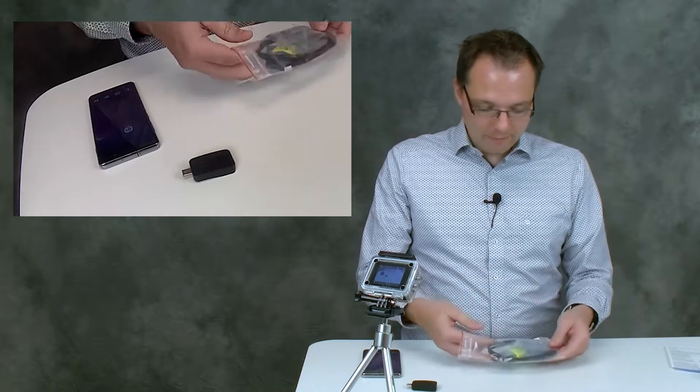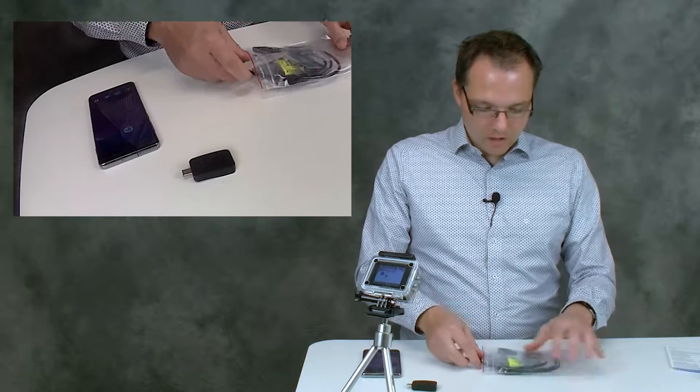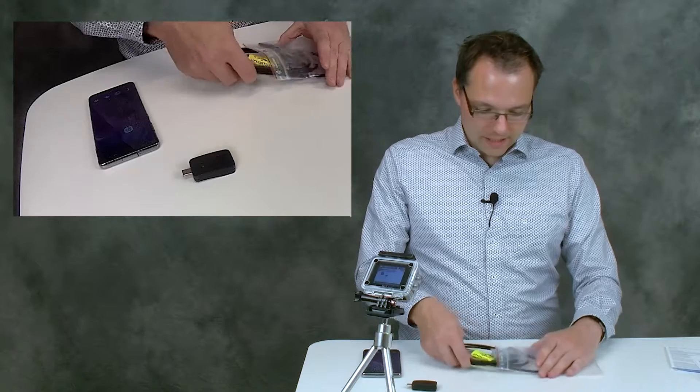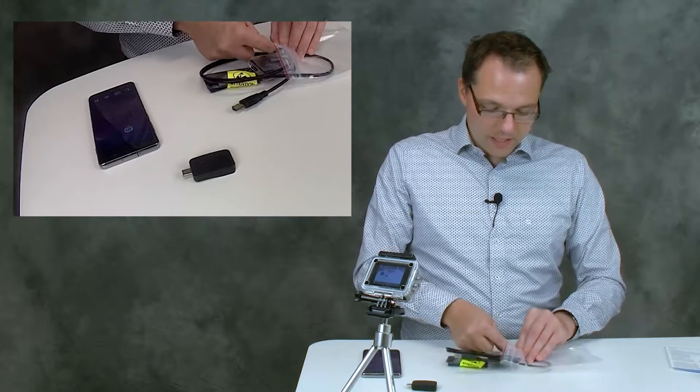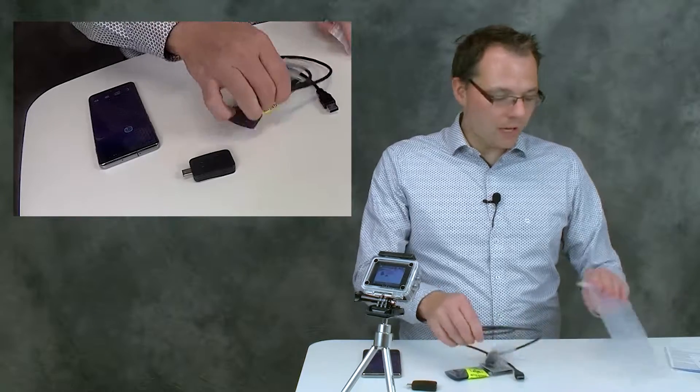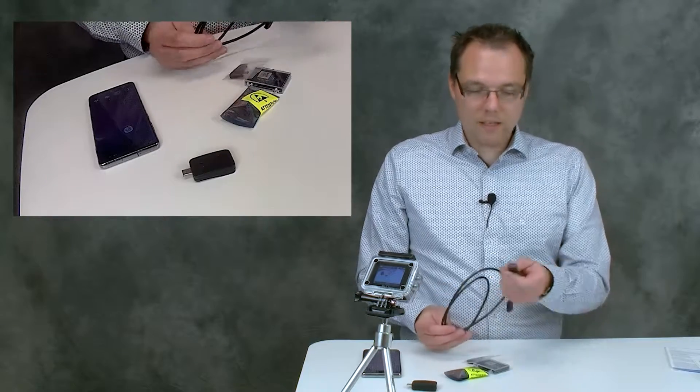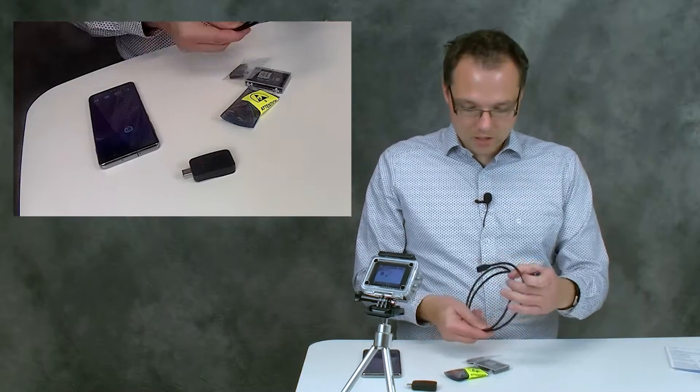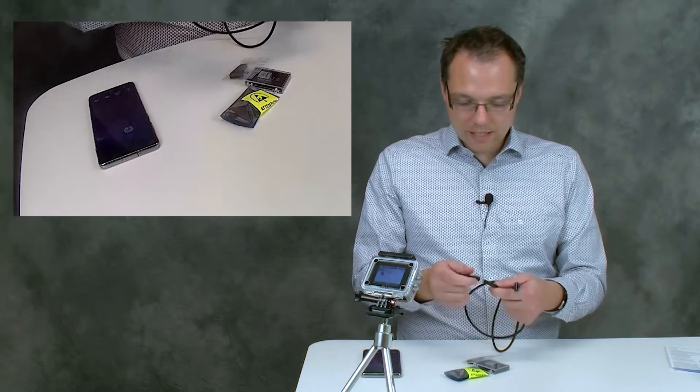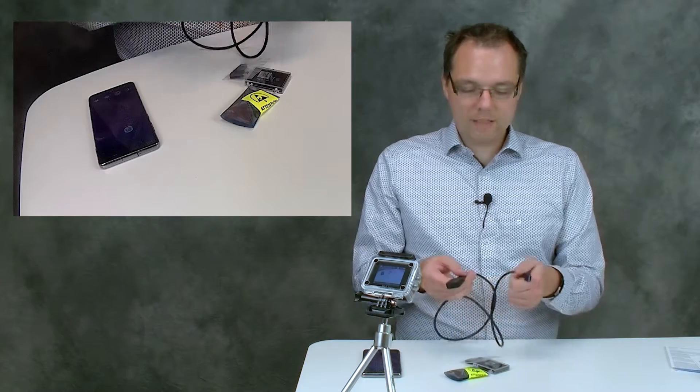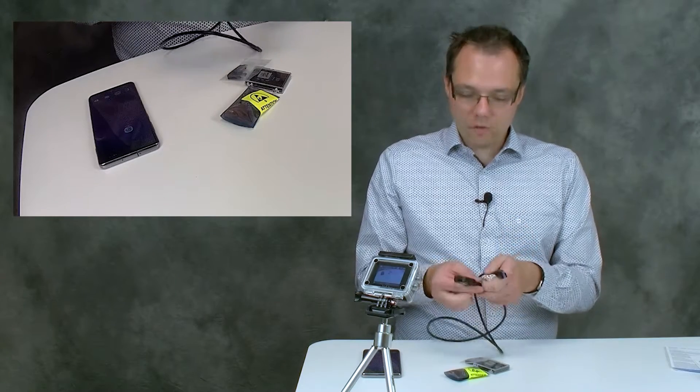What else will you find in here? You find in here a USB cable that is very handy if you're using a computer or laptop that only has the big USB connections. You have on the other side a female USB-C and can just connect the Sensit Smart, and then you have a flexible connection for a big USB.